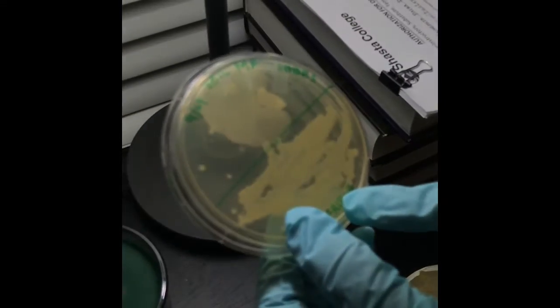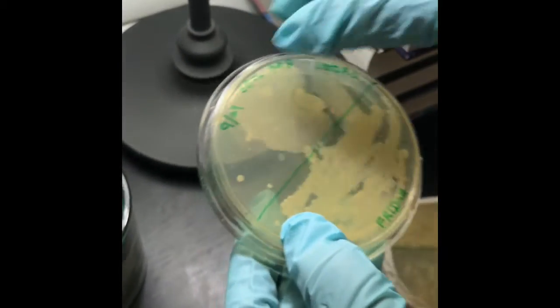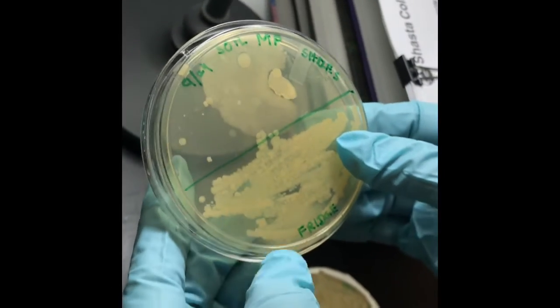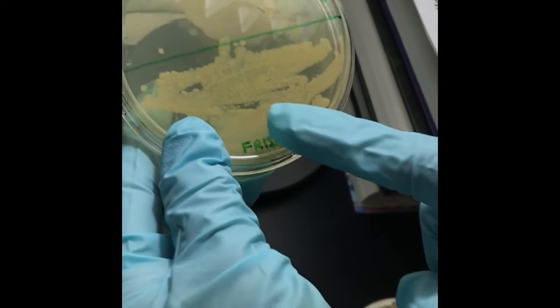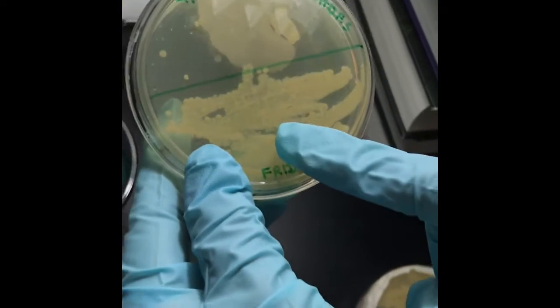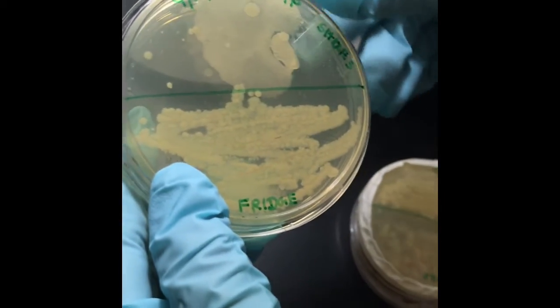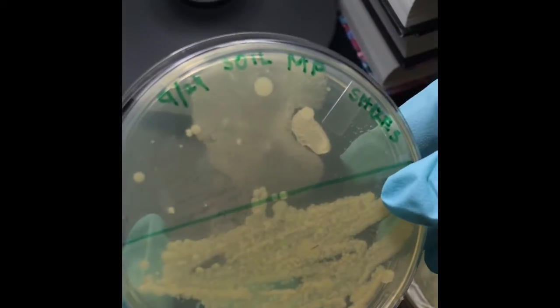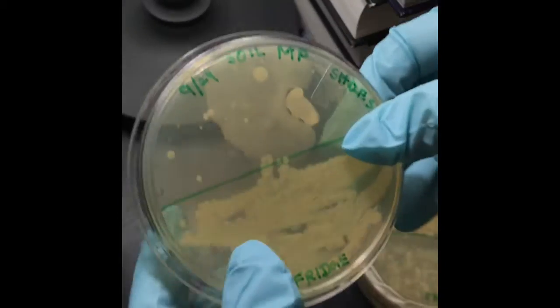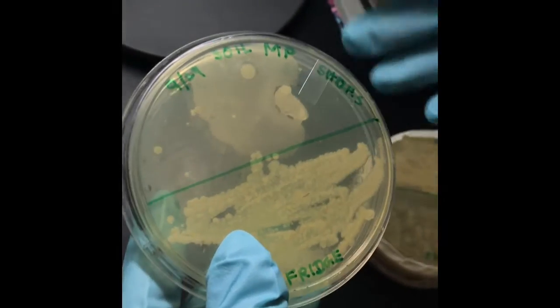So this is from my fridge. As you can see, this is a TSA plate, and you see the labels, one more time I'm showing you, they're at the edge. This part is actually the swab from the fridge, and this part is from my shoes. So we can see how they have grown over here. The type of growth is also different. Maybe the shoes one will develop a mold, I'm expecting. Let us wait and see.